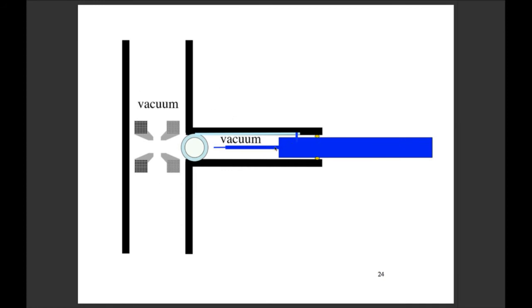So you put in your sample, there's a pin, and it activates the sensor that starts pumping down air from this region right here. Once that's all pumped down, then the sample gets entered into the actual column, at which point there is no actual pump pumping down air. It's what's called an ion getter pump.